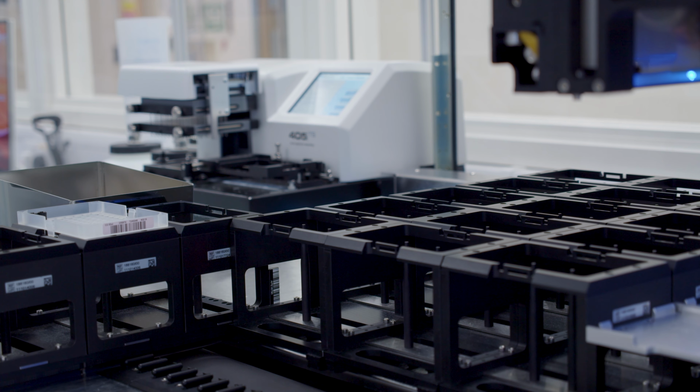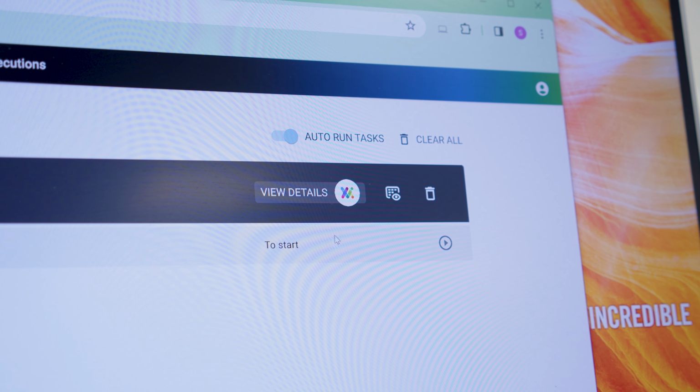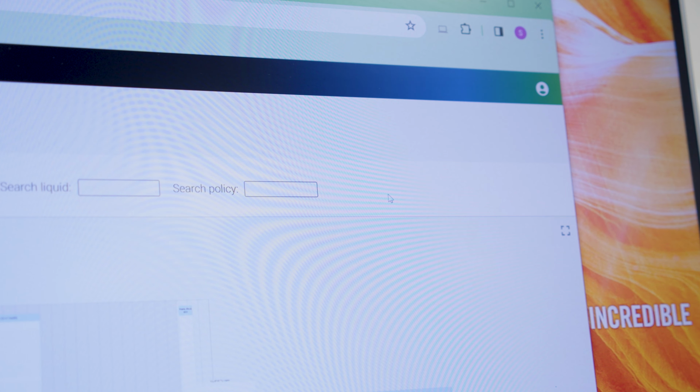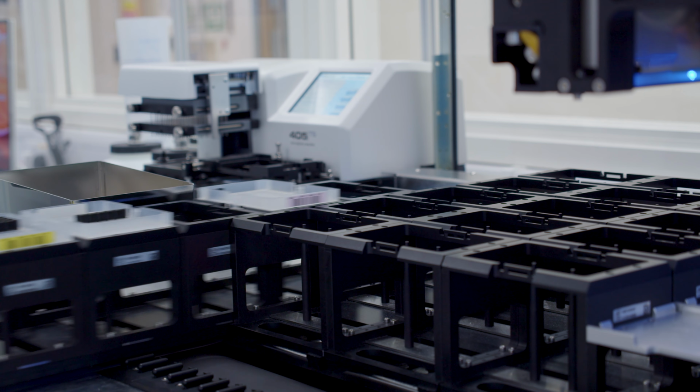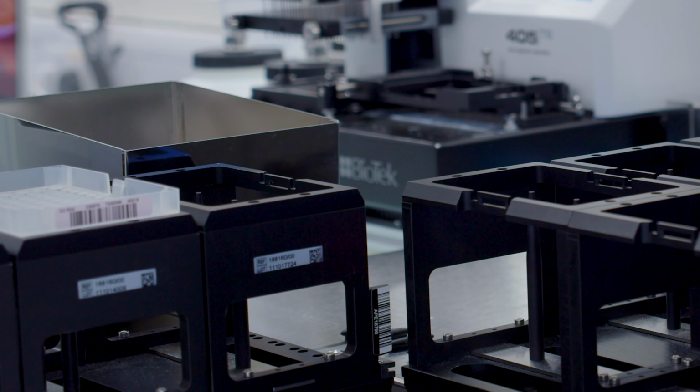Before we start the run, we'll need to set up the Hamilton deck. To do this, click Show Preview on the Synthace Hub execution, and then we can set up the Hamilton to match this layout. First, load your tips.